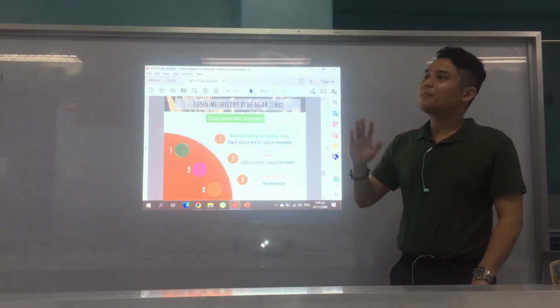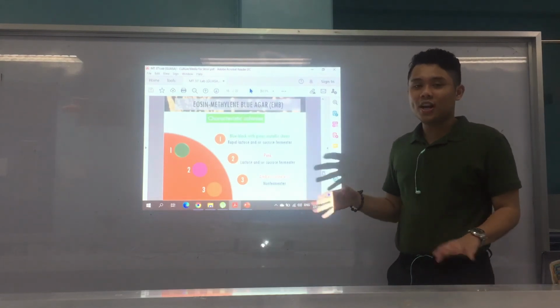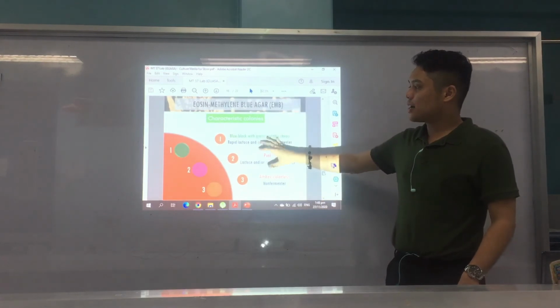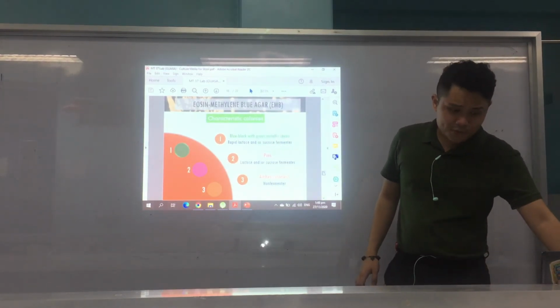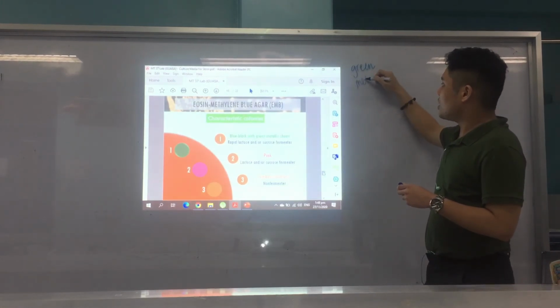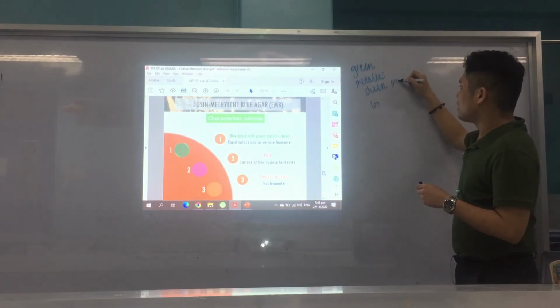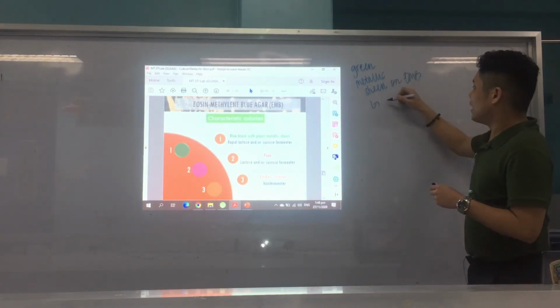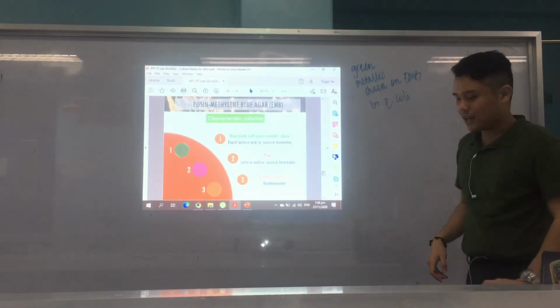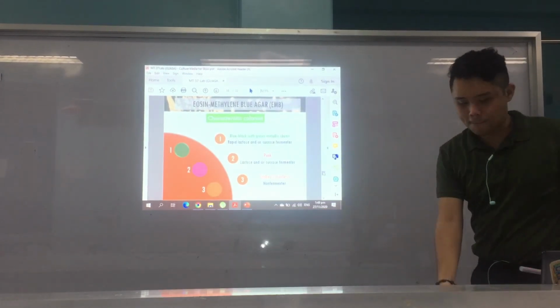So actually, the results are eventually the same if you are a non-fermenter, because the color doesn't change, either colorless or no change of color, right? Alright? And what is really characteristic for your EMB is the organism that produces the green metallic sheen, right? Do you recall? Green metallic sheen, who is this? On EMB, you have E. coli, right? E. coli, green metallic sheen on EMB, E. coli.